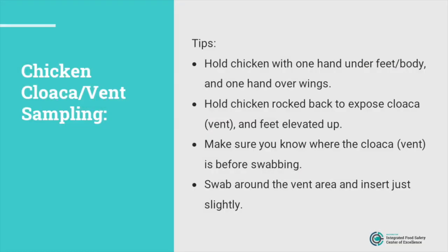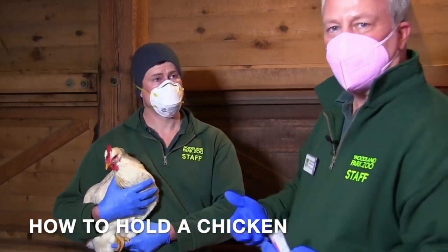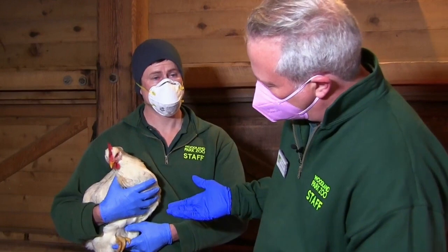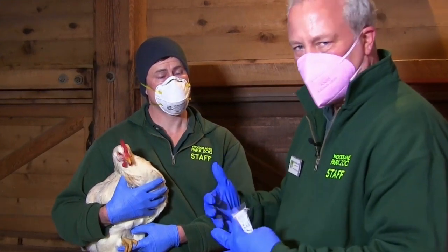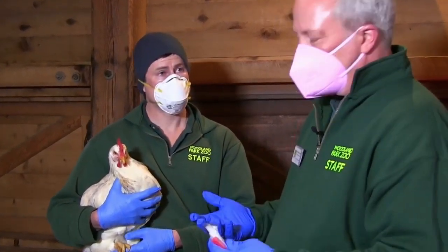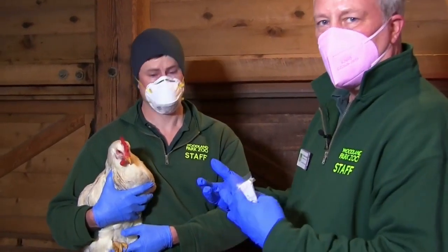Next, we're going to do sampling of our chicken. She's being held in a proper way to make her feel like she's not in danger of falling. Evan is holding his hands underneath the feet and the body, wings kind of contained so she doesn't feel like she needs to struggle. Now, the next part she's not going to like as much — we're going to tip her back, exposing her cloaca or vent.